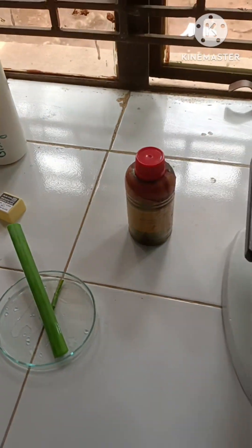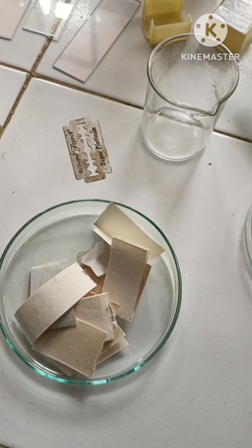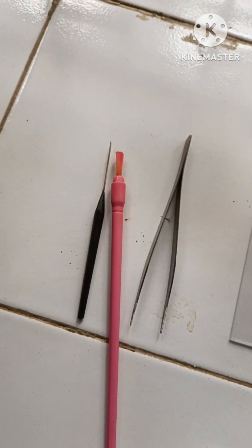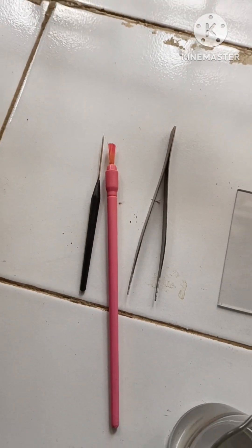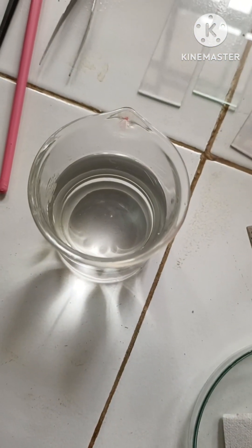So for this purpose the materials required are: the stem cuttings, microscope, safranin, glycerine, blotting paper, cover slips, slides, brush, forceps, needles and blade for making the cutting, and water for washing the excess stain.